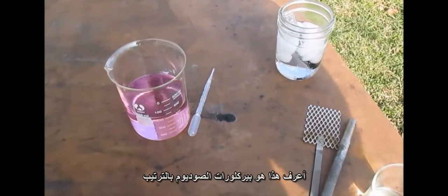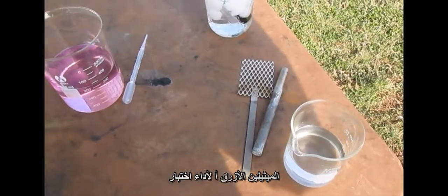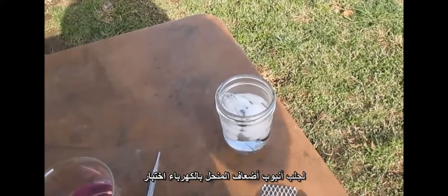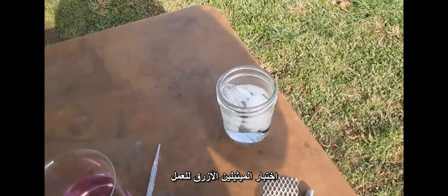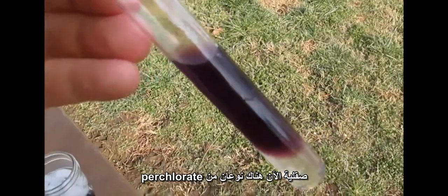So how do we know this is sodium perchlorate? In order to perform the methylene blue test, a sodium hydroxide solution was added to a test tube full of the electrolyte to bring it under basic conditions in order for the methylene blue test to work. After adding a few drops of the methylene blue solution, the violet color and the precipitate indicates that this is sodium perchlorate.